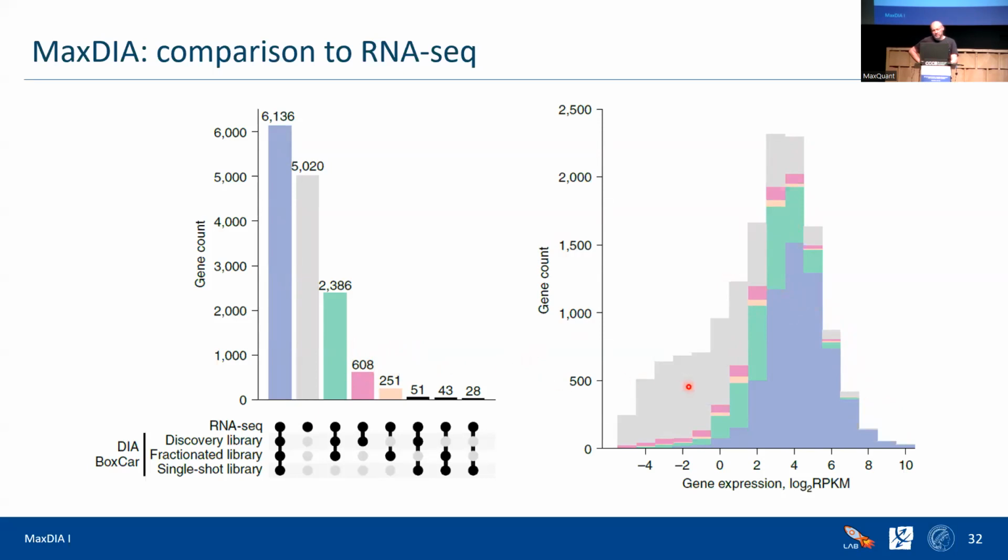What's also interesting, we didn't filter the transcriptomic data by RPKM larger than 1 or log larger than 0. So that's why you have this bimodal distribution for the transcriptomic data. But what is actually good to see is that from this left mode, almost nothing is identified by the proteome, and that's how it should be, because this left mode you would usually not consider in transcriptomic analysis, because it's things that are not believed to be resulting in a protein.